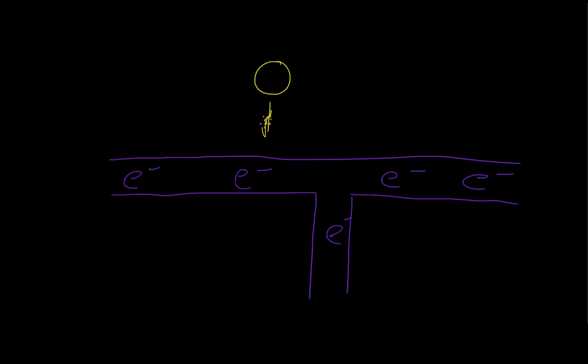This is my metal wire, and it is full of electrons because it has electricity built up within it, and that is what that is. So our ion comes in, and sorry, I scrolled a little there, ruined my arrow.